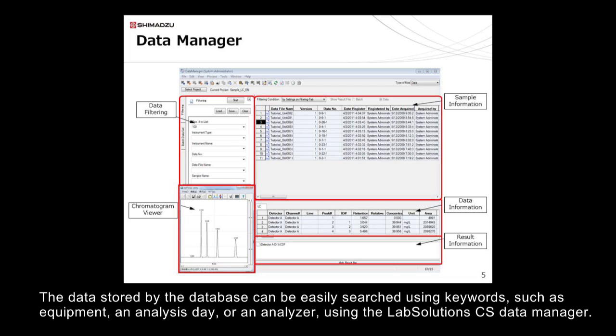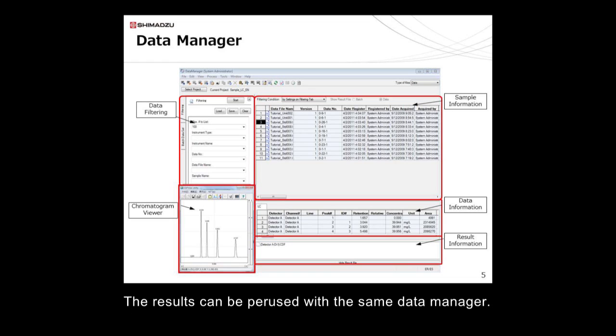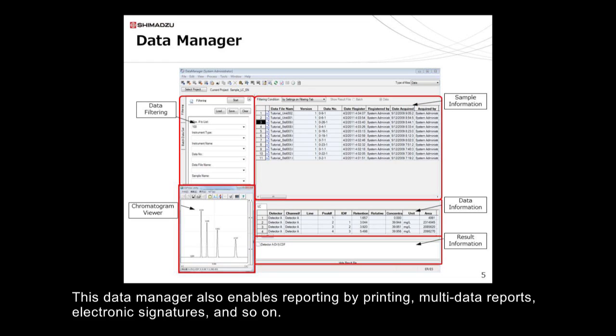The data stored by the database can be easily searched using keywords such as equipment, analysis day, or analyzer, using the Lab Solutions CS data manager. The results can be perused with the same data manager. This data manager also enables reporting by printing, multi-data reports, electronic signatures, and so on.